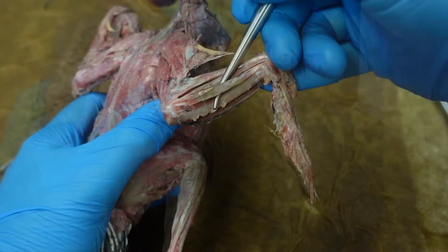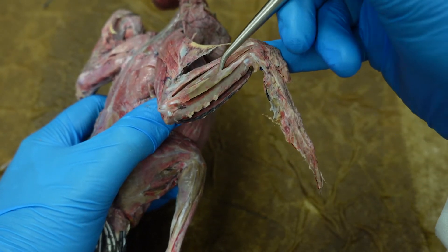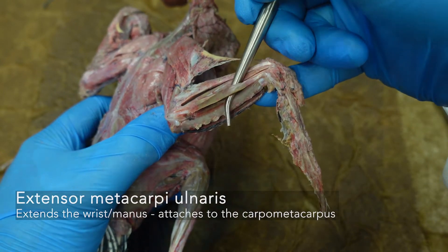This group here — and lastly, laying along the surface of the ulna, you can actually see our ulna right here — laying along the surface is our extensor metacarpi ulnaris.